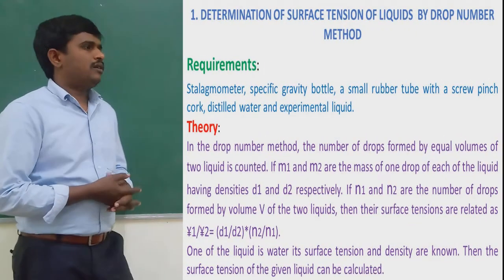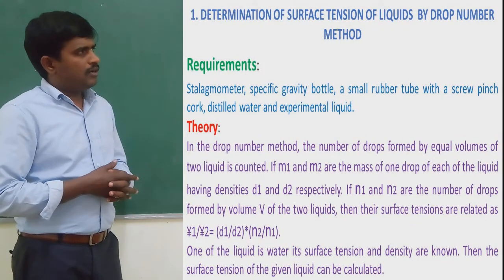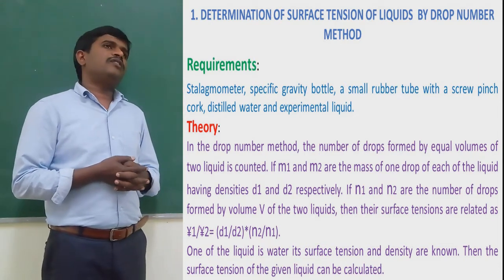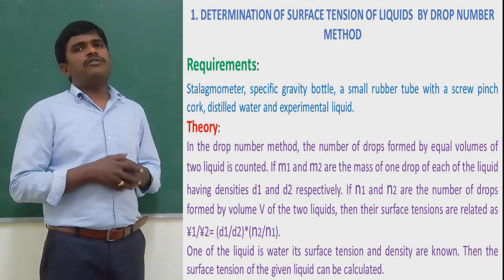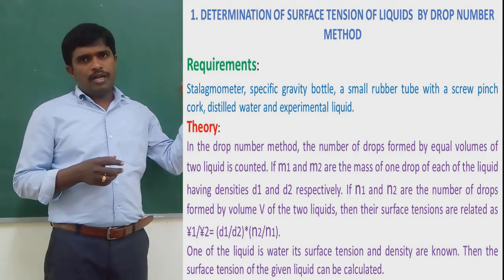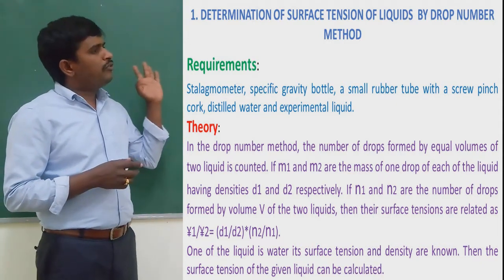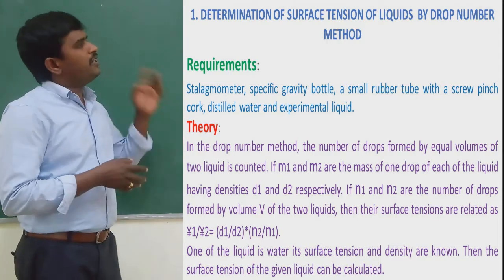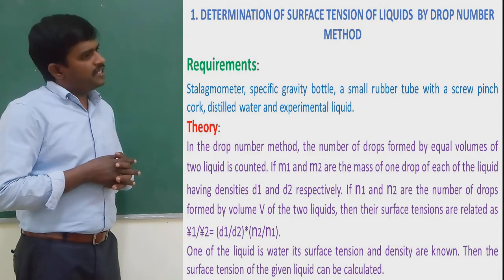Coming to the important aspect of this presentation, that is determination of surface tension of liquids by the drop number method and drop weight method. Many methods are there for the determination of surface tension.